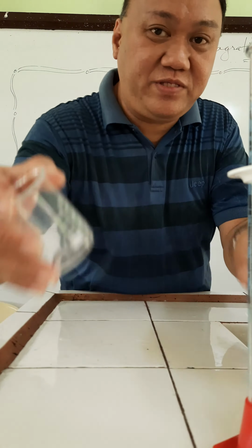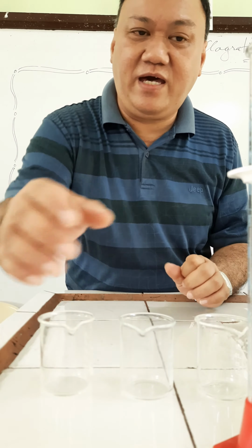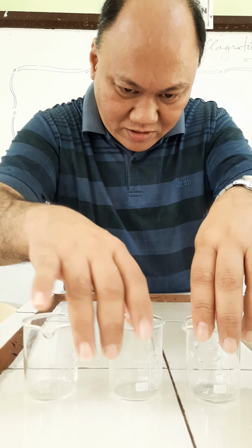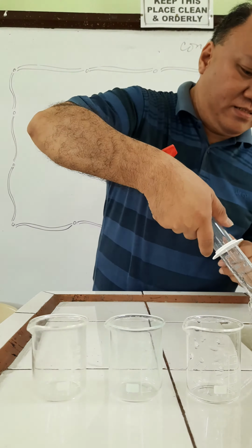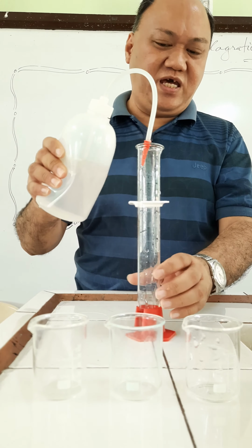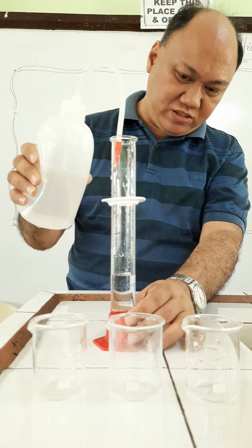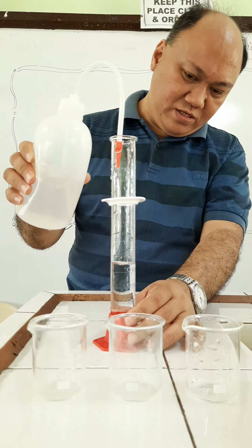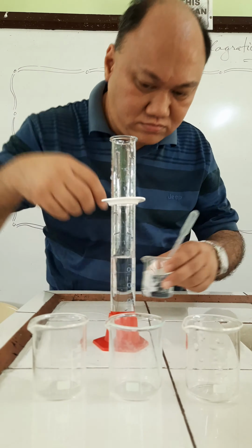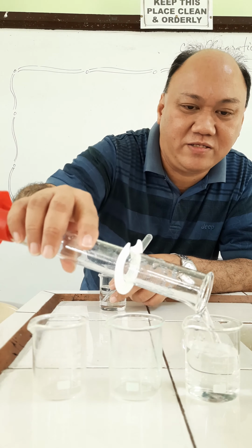Okay, so we have 3 beakers, beaker 1, 2, and 3. These are 50 ml capacity beakers. I'll fill these beakers with 50 ml of water, all 3 of them, using our standard liquid measuring device, our graduated cylinder. Okay, it's 50 ml. I put it on beaker 1.